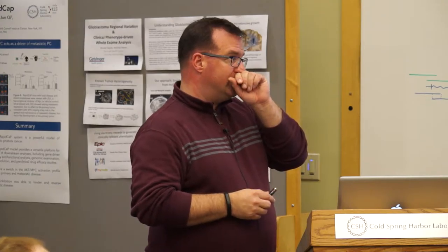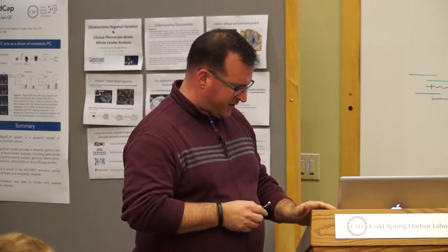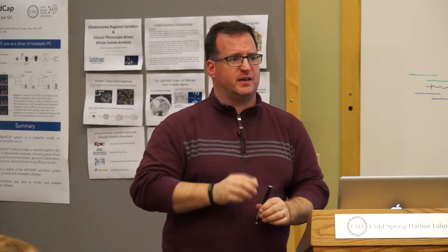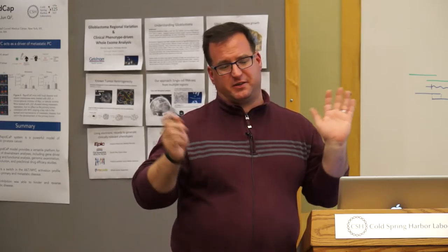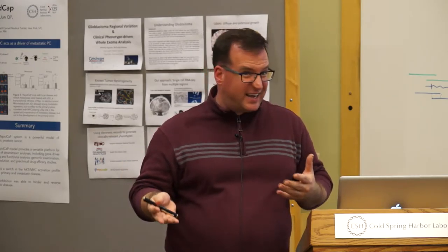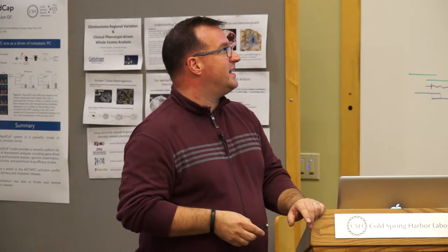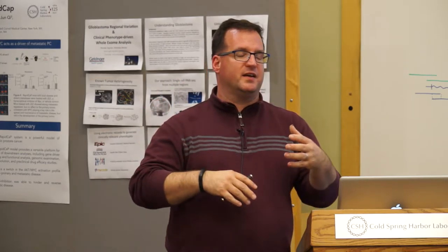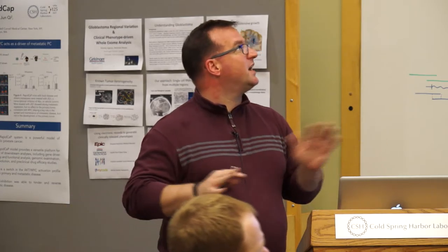Okay, not so much of an issue anymore, but it used to be an issue. A major question people would always ask is, fine, how many lanes do I need to run? Because my sequencing core told me it was $2,000 per lane, but I've got 12 samples, so what does that mean? Do I need to do 12 lanes? What do I need to do? This slide used to be more complicated because it depended on what your sequencer was, how many reads you wanted, and how many reads you could get out of a lane. It's not the case anymore.